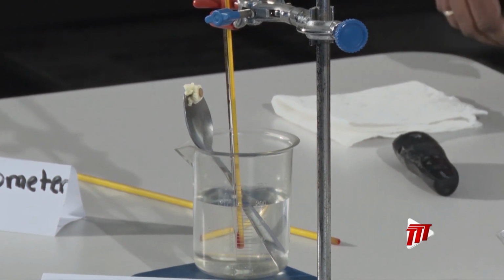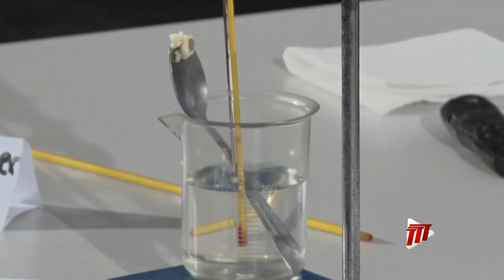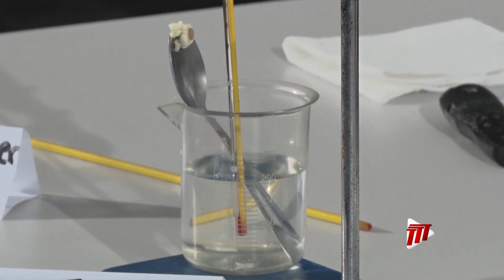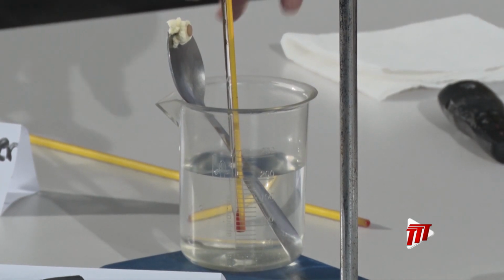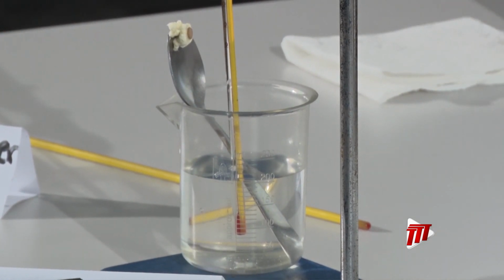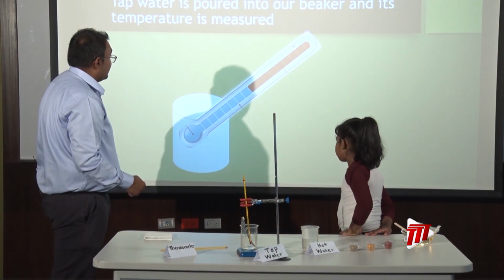And we observe. Again, we use our senses, being scientists, young scientists, old scientists, or just being curious. We are looking now at what would happen with the tap water at room temperature, what happens to the bean on the butter, on the spoon. If you look at it, we have our beaker with our thermometer, and importantly, as we said, it's completely submerged, not touching the edges.